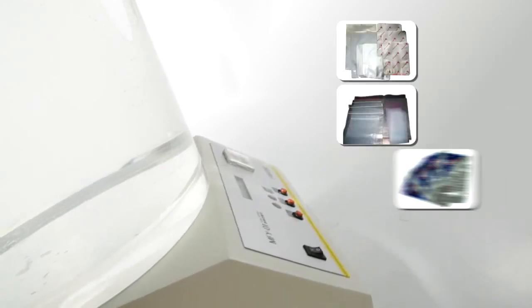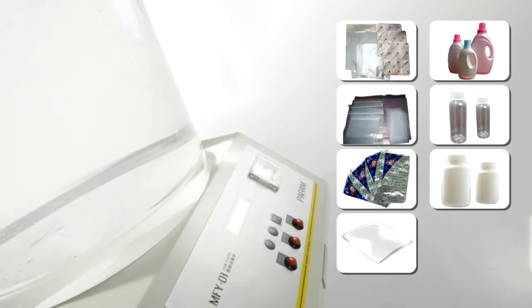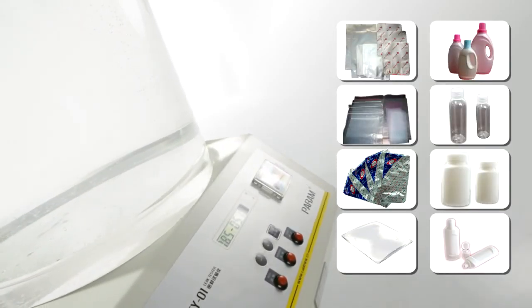The instrument can be used for leakage testing of pouches, bottles, cans, and other sealed packages used in different industries.